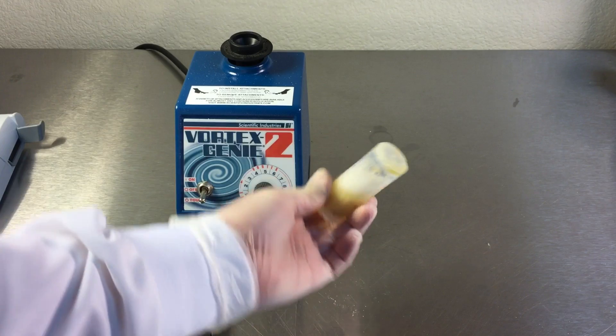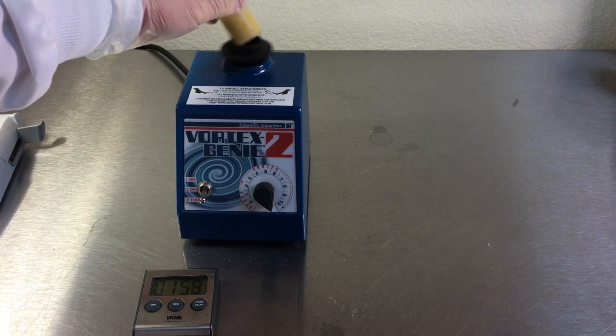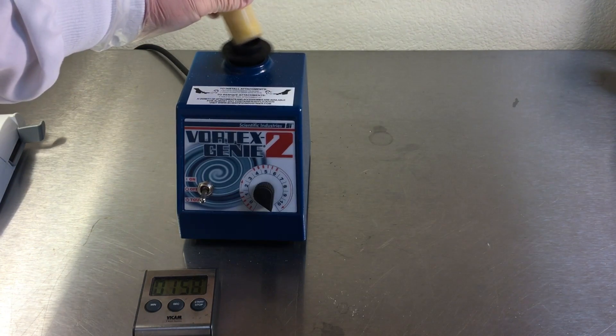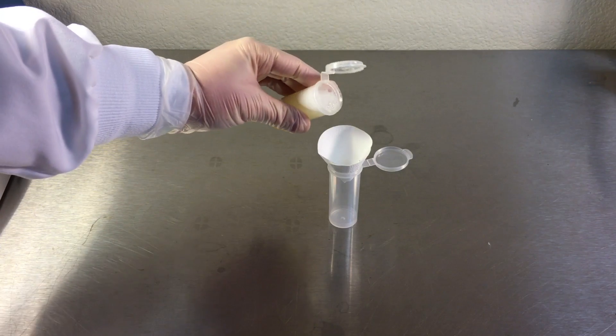Seal the lid of the extraction tube. Invert once to fully incorporate the sample. Vortex the mixture on high for 2 minutes. Filter the extract into a new sample extraction tube.